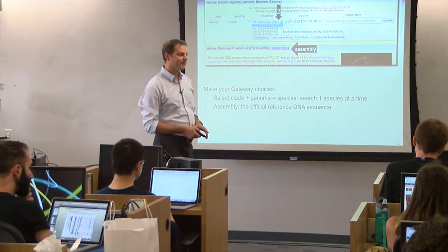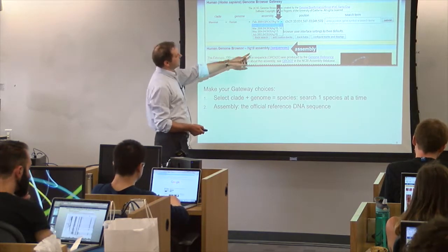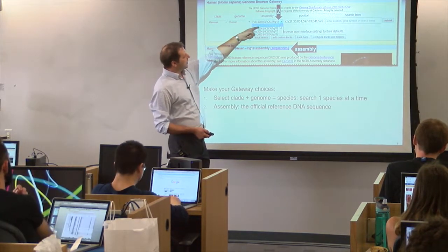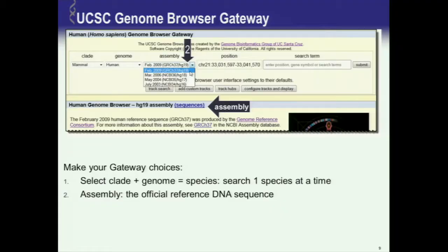Yeah? Why would people not work in those current builds? So, yeah, these slides were made a little while ago. There's a newer build now. It's called GRCh38. They've dropped the HG numbering just to confuse everybody. It's sort of legacy things.